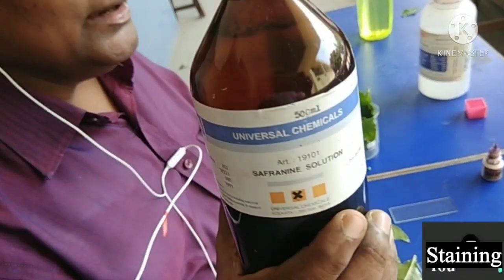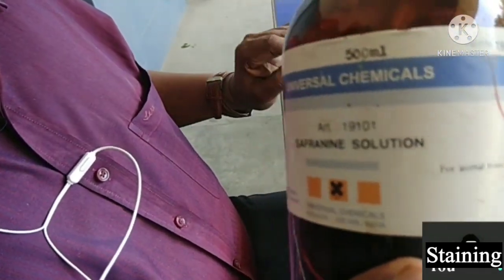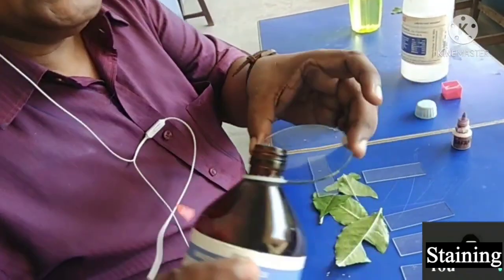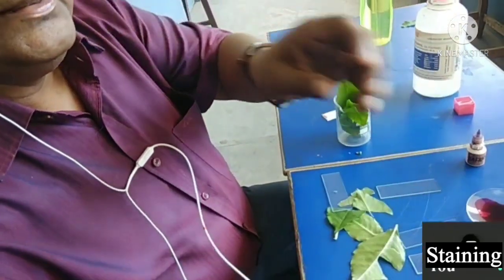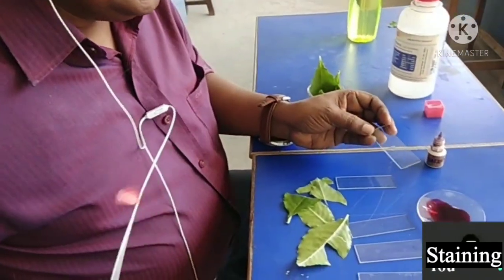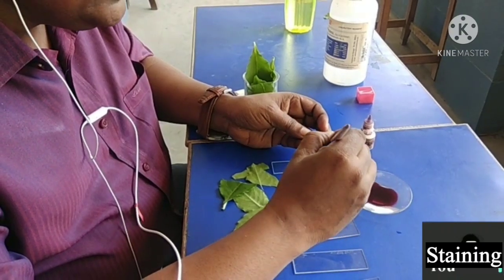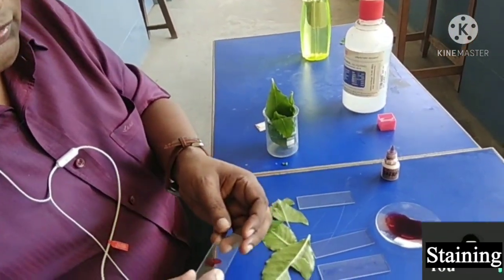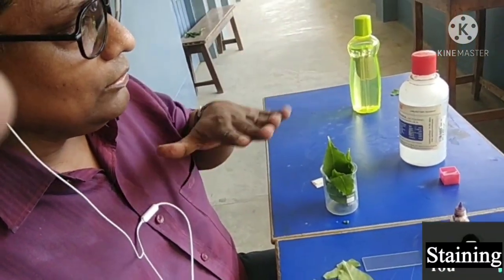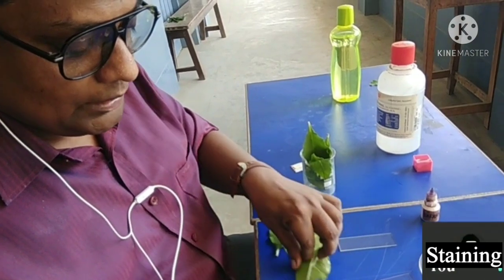This is the staining material — it is safranine. You can read it: safranine solution. I think in class 9 also you have used safranine solution. I am taking it — it is red in color and is useful for staining plant and animal material. The use of staining is that we can see the structures properly under the microscope; otherwise many things are transparent and not visible properly.